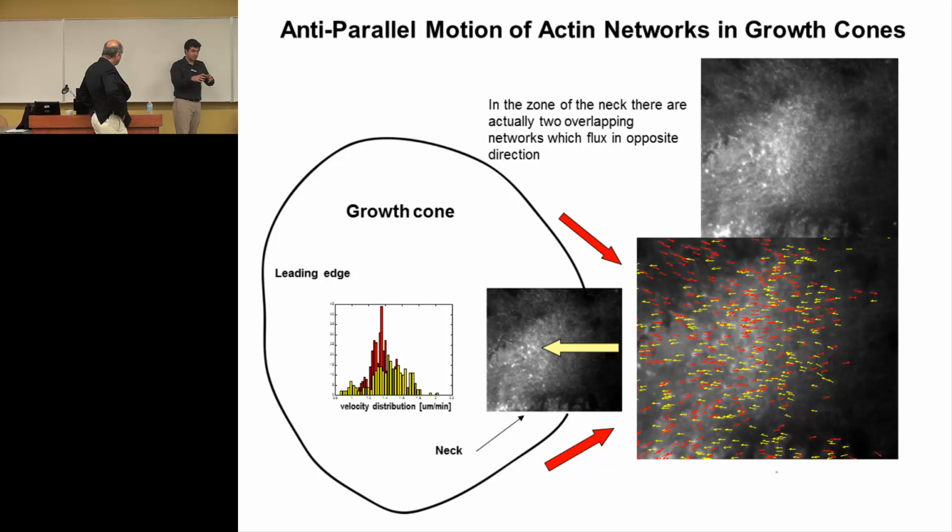The cell division is not really a cell, it's an extract. So what they have done is they've broken the cell wall, just to get the stuff outside so they can manipulate it with needles and things like that. So they're not confined by anything, so they are moving around sometimes, yes. So the registration and alignment is an additional problem. But what we can do is image 100 of them and select the 10 or 20 that don't move as a first approximation and do some tracking. But some of them really move a lot.